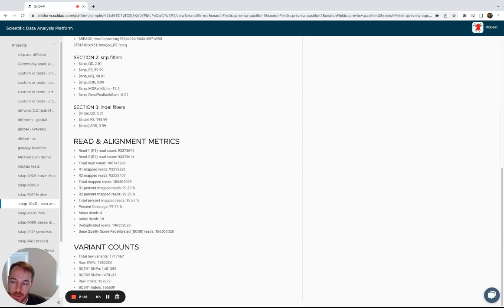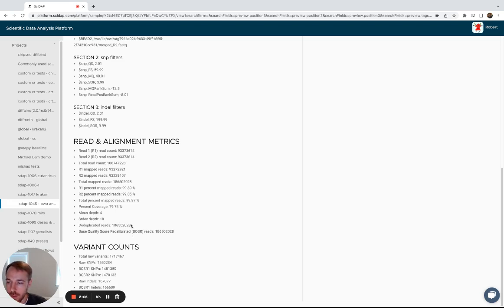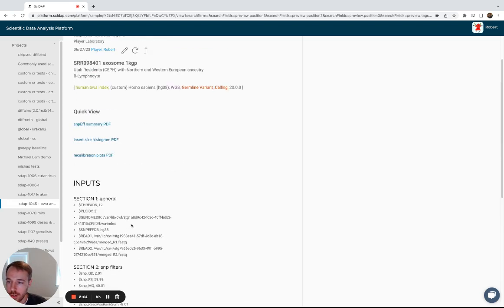Some read and alignment metrics, and then variant counts. So total counts, counts for SNPs and indels, both before and after base quality score recalibration.